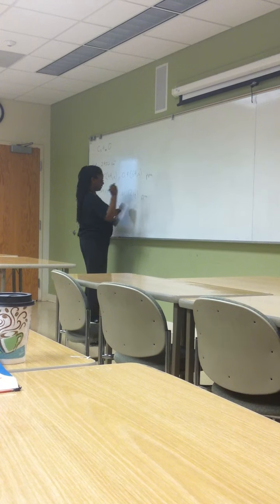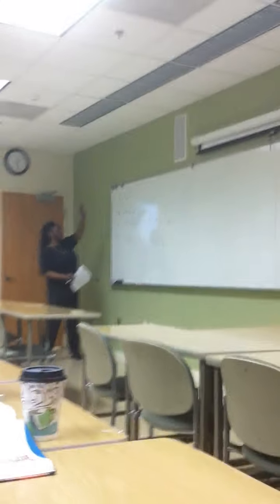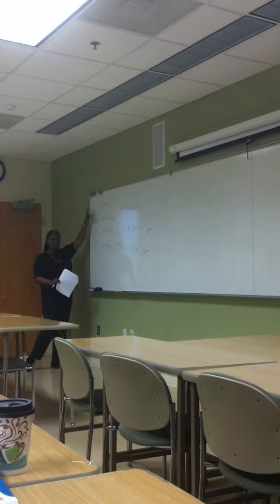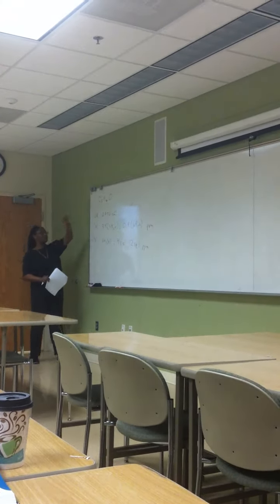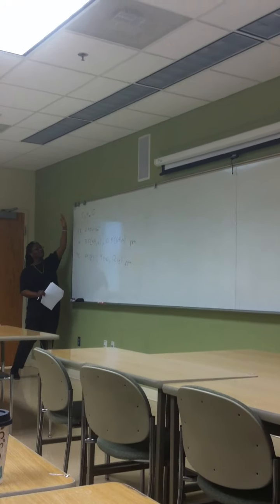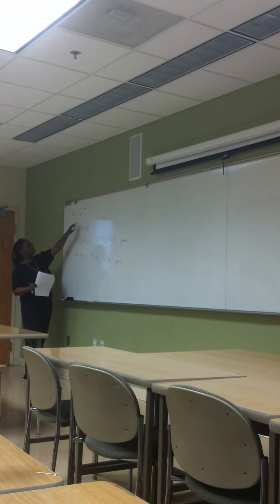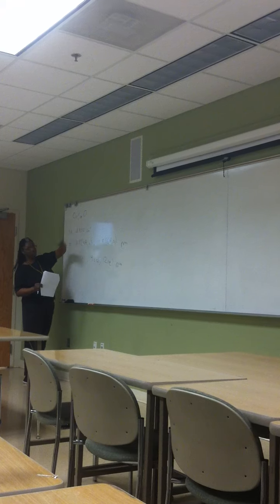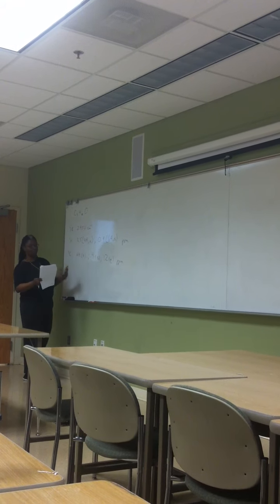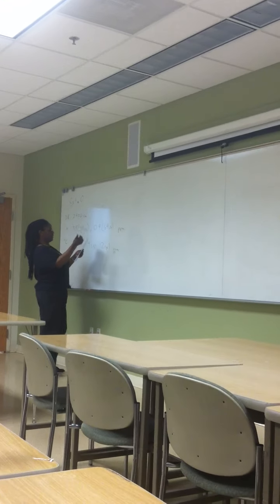Okay, so the first step on all of these things is to determine the degree of unsaturation for these. Because for mass spectrometry, you can find the molecular mass and molecular formula, and you can start to put together some of the structural information, but I didn't give you that information. I gave you the formula, so you need to figure out the degrees of unsaturation. There's a formula in your textbook.